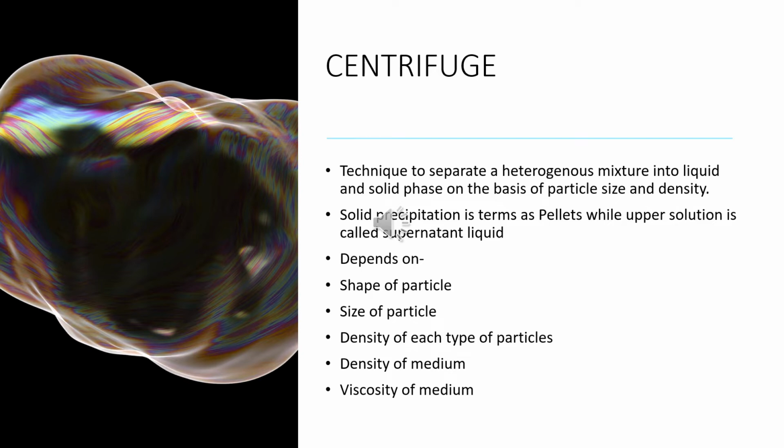The rate of sedimentation depends upon some factors such as shape of particle, size of particle, density of each type of particle, density of medium, and viscosity of medium. The larger, denser particle tends to sediment more quickly than the smaller, less dense particle.